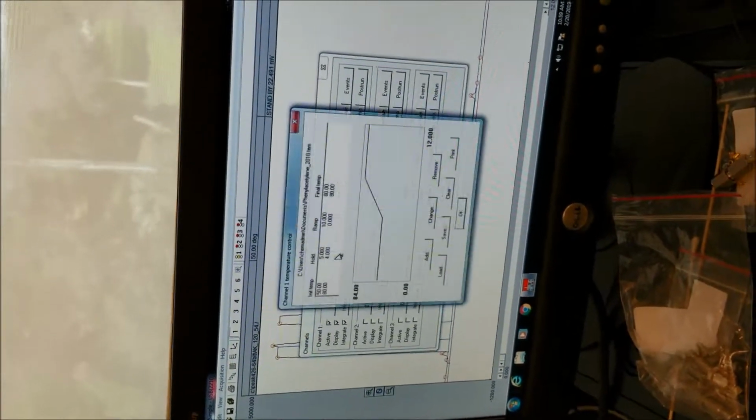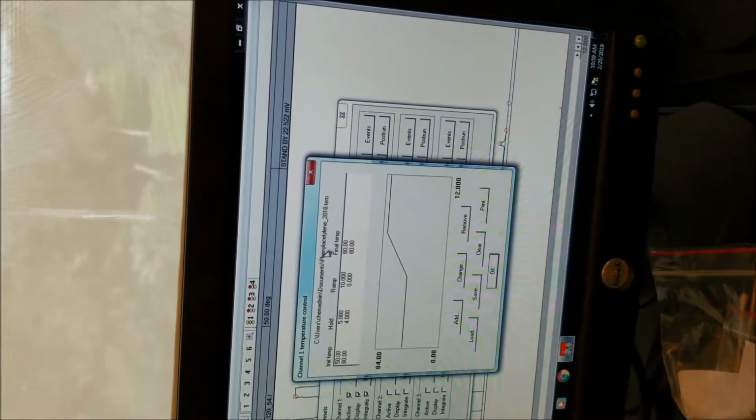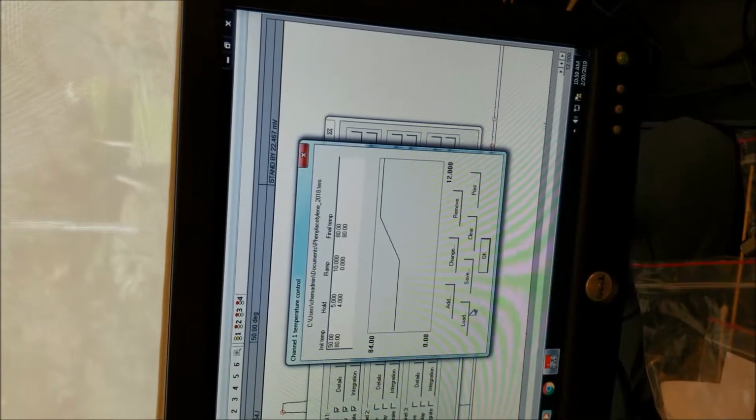for the phenylethanol, once this GC is running too, they use the same software, but we're going to use a similar method. You go to Channels, and then you go to Temperature, and we're going to load a separate temperature program. You see right now we're using the phenylacetylene 2018 program, so I'll go to Load, and I have a method that I have labeled Cool.